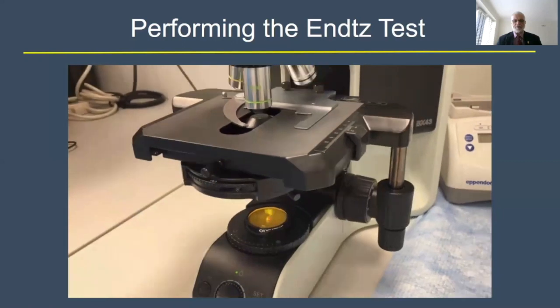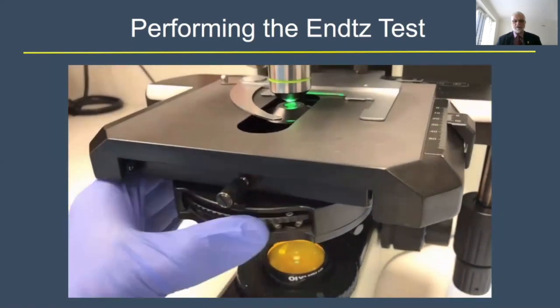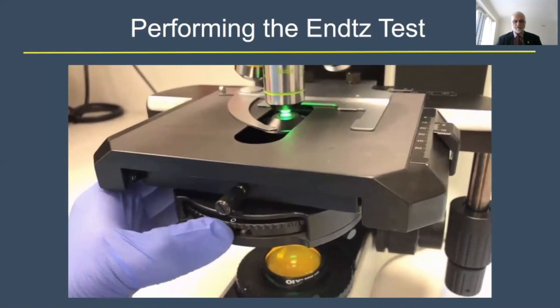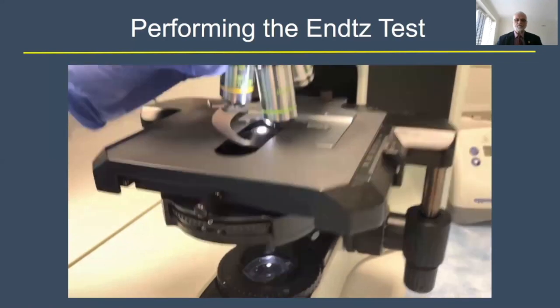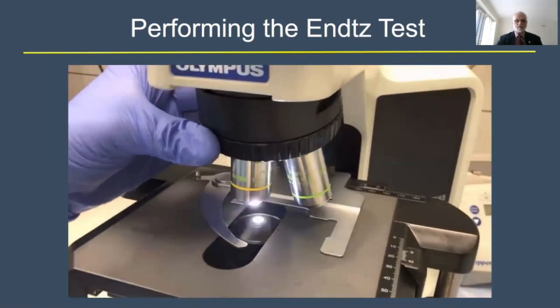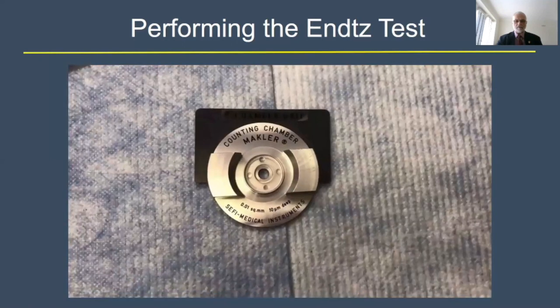Afterwards, you prepare your microscope with bright field, maybe take away the filter. It is used with a 10 times objective lens.